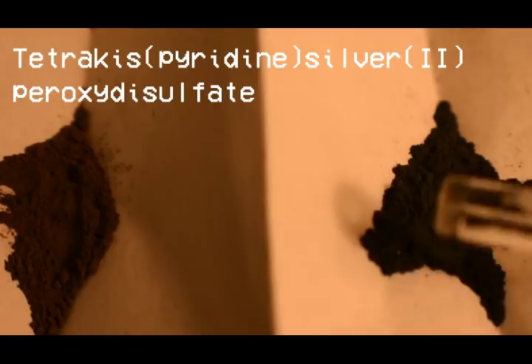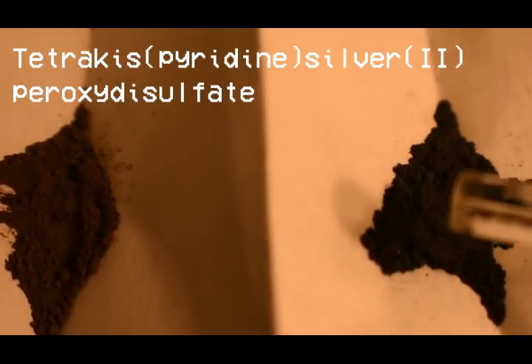A few interesting things I just found out about this one here on the right, silver 1-3 oxide, is that it can actually dissolve into concentrated nitric acid to give the silver 2+ ion, which is pretty unusual. There's only one complex that I know of that has the silver in the plus 2 oxidation state, and that's some sort of pyridine, like tetrapyridine silver 2 persulfate or something like that. But I don't have any pyridine, otherwise I'd make it. It's also the oxide that is in silver batteries.